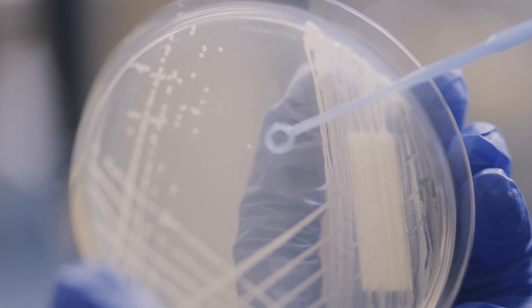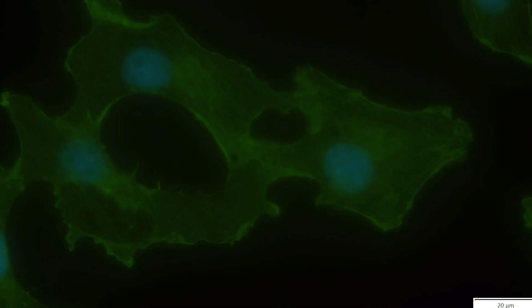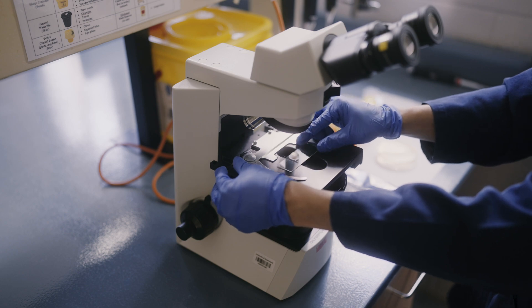Cells are the foundational unit of living organisms yet embody incredible complexities at the molecular level. To zoom in on the microscopic machinations of life, scientists use specific detection methods to separate the signal from the noise.